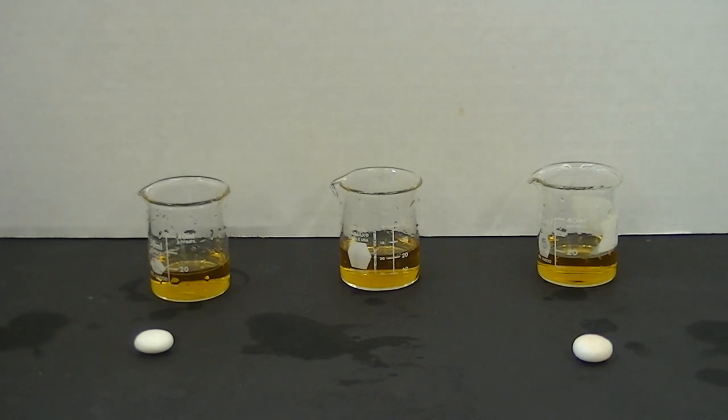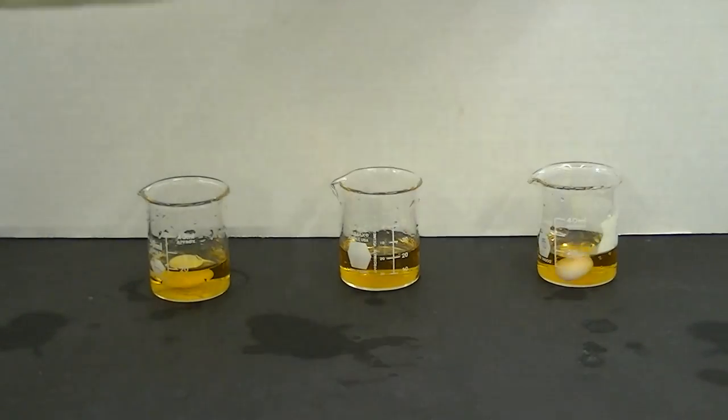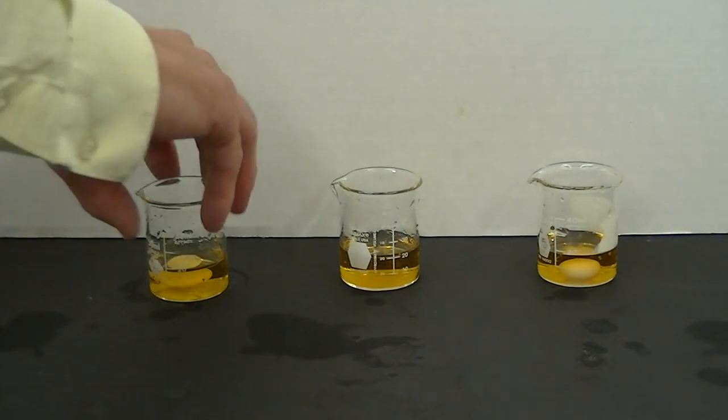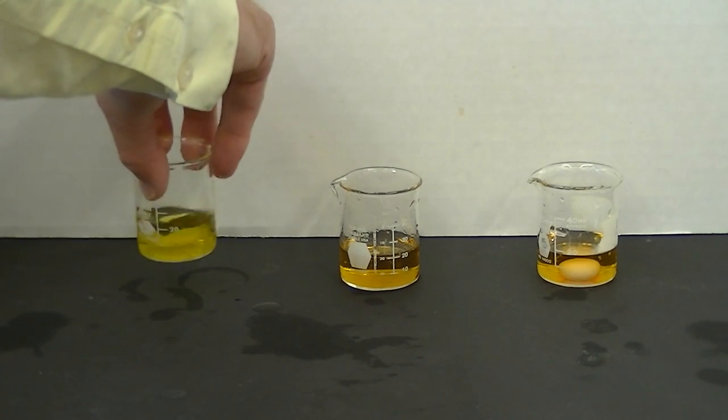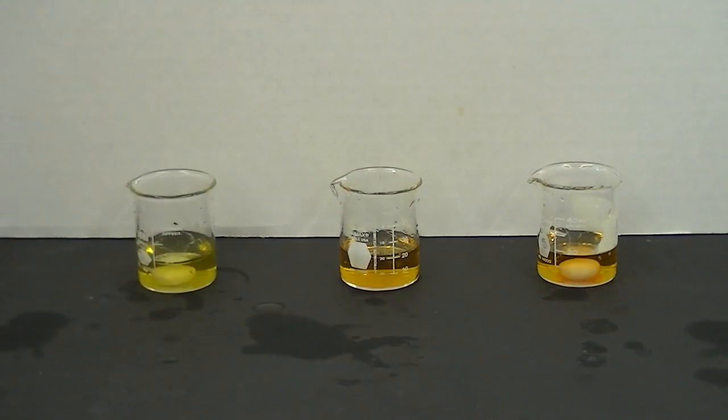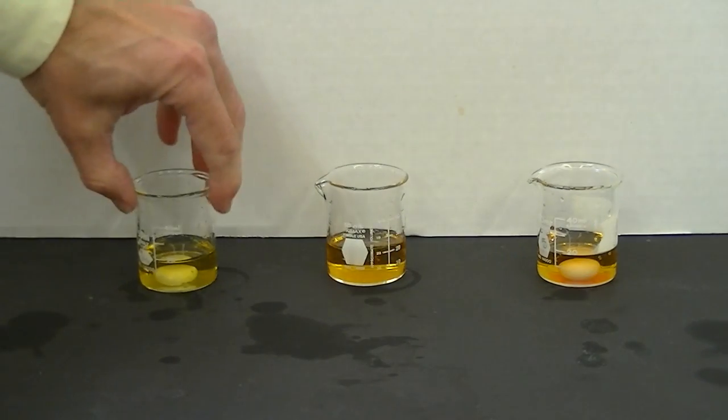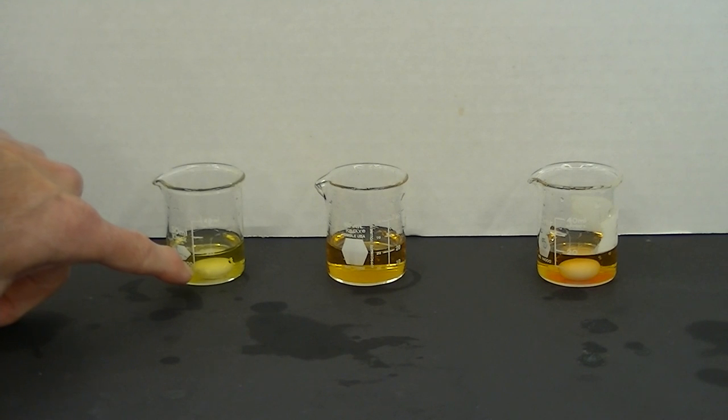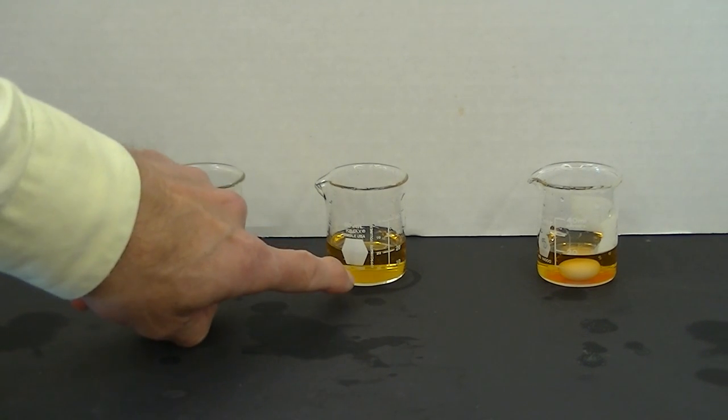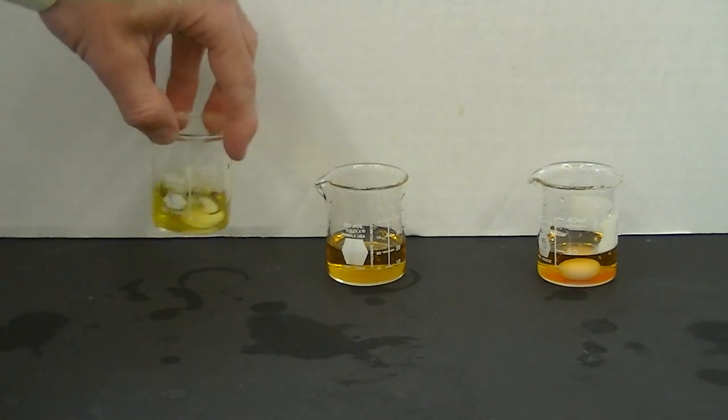I'm going to place them each into these outside beakers and then I'm going to swirl. What you'll notice with this particular Mentos candy is the color is shifted from a yellowish color to maybe a little bit green. That indicates the presence of a base because the yellow is slightly acidic and the green means that this is somewhat neutral.